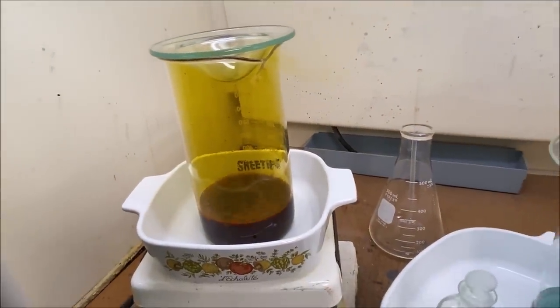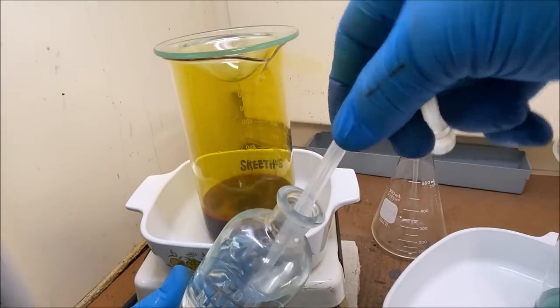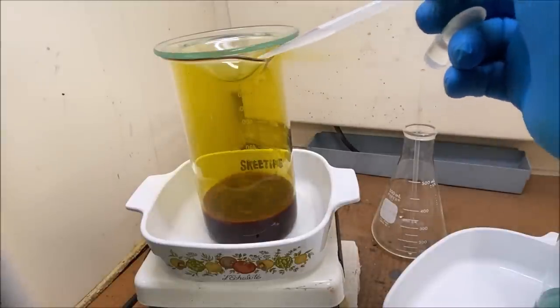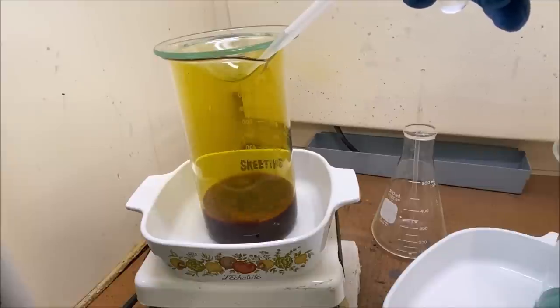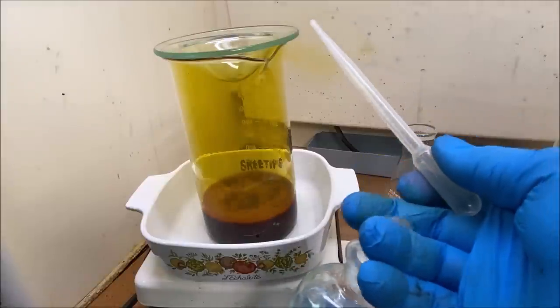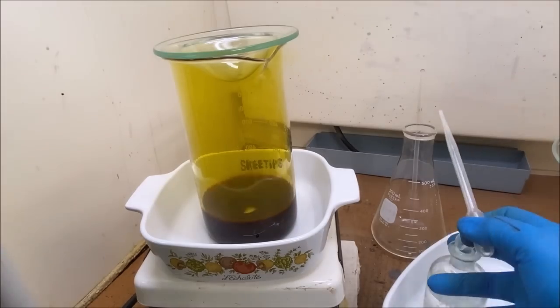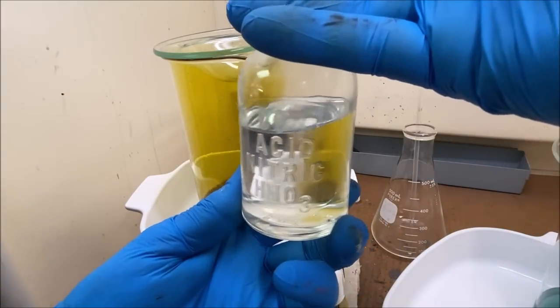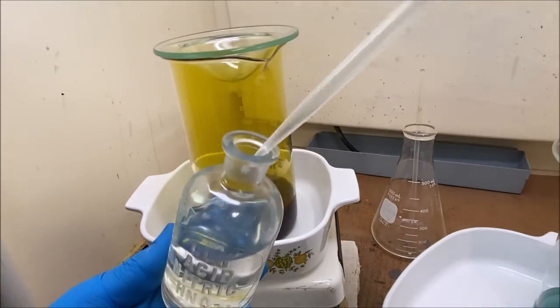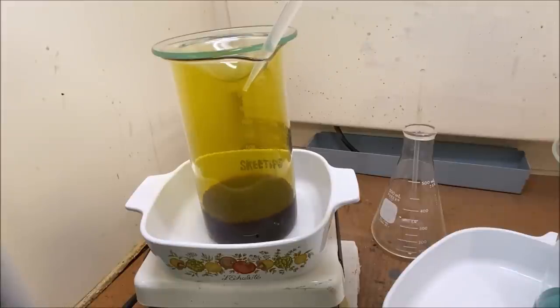solution. What we'll do here is drop in a little bit of nitric acid here. Not much, just a little bit, because I don't know how this is going to react. About a half of a milliliter of nitric acid. I'm going to drop in a little bit more nitric acid. It's about 2 milliliters. I'm going to add it real slow.